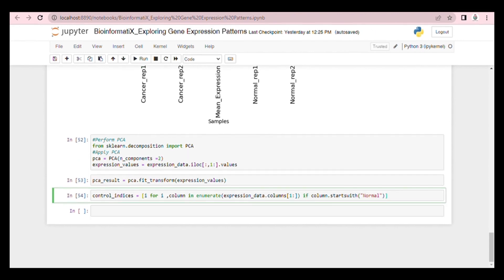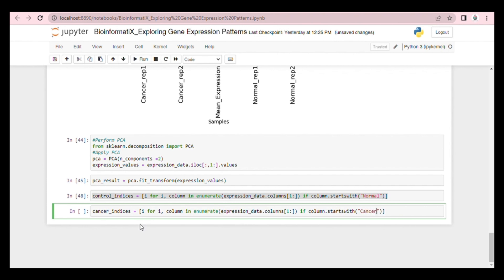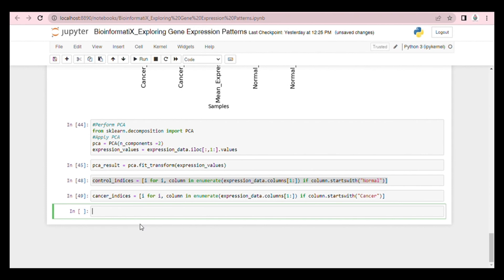This code creates a list of indices for each column in the expression data frame, starting from the second column. It checks if each column name starts with the word 'normal' — because in our case we are looking for the normal RIP1 and normal RIP2 columns. If it does, the corresponding index is included in the list, so the code finds the indices of columns that have names starting with 'normal'. Then we plot the PCA result with different colors for normal and cancer samples.